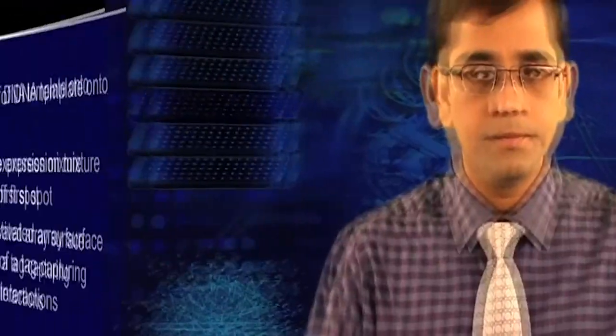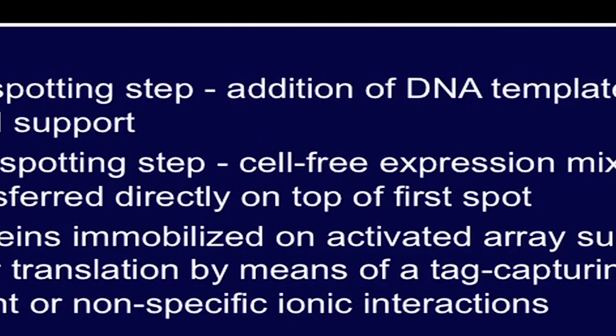This is another approach which facilitates generation of high density protein microarrays by using cell-free expression system. In MIST approach, both DNA and cell-free expression system are printed on chip surface. Two rounds of spotting are performed. In the first spotting step, DNA template is added to the microarray solid support, and during second spotting, cell-free expression mixture is transferred directly on top of the first spot which contains DNA.